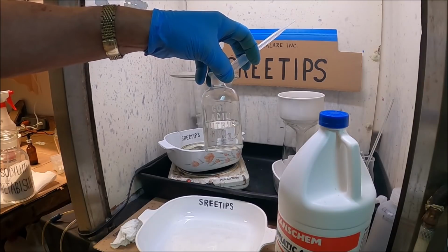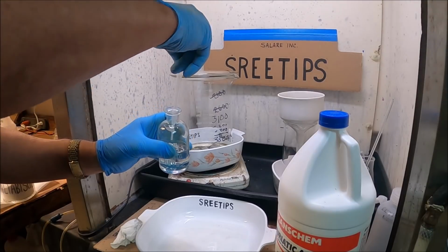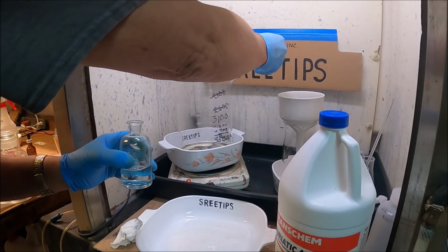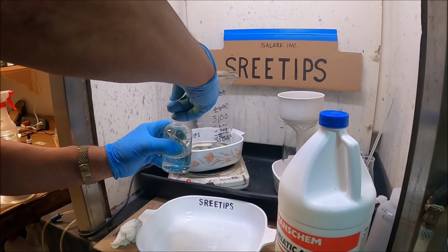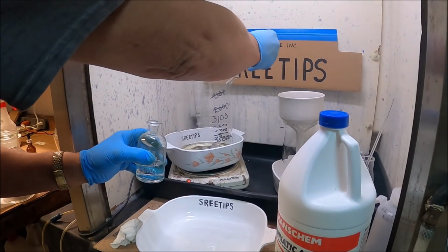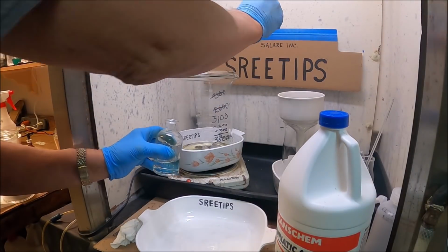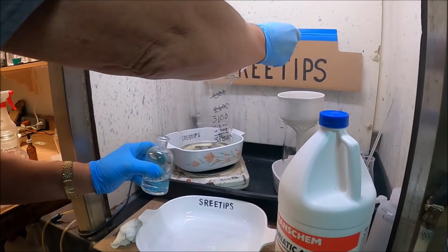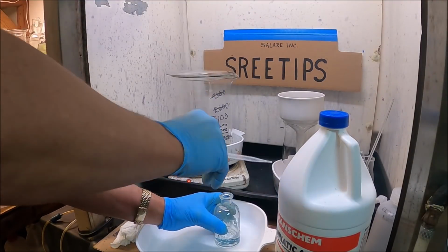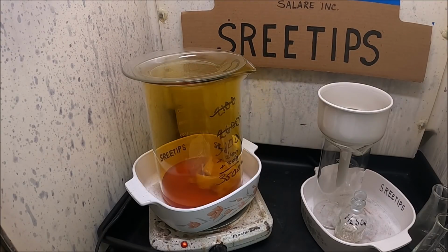Nitric acid. I'm gonna add about, maybe 15 milliliters. Let's do that. That's 3, 6, 9, 15. Now we'll just let this react. The filter paper will completely disintegrate and aid us when we filter out all the solids out of this solution.